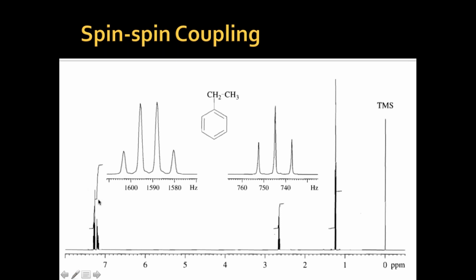So without seeing the structure of the molecule, you should be able to tell from the spectrum what kind of molecule, what kind of NMR you are having.